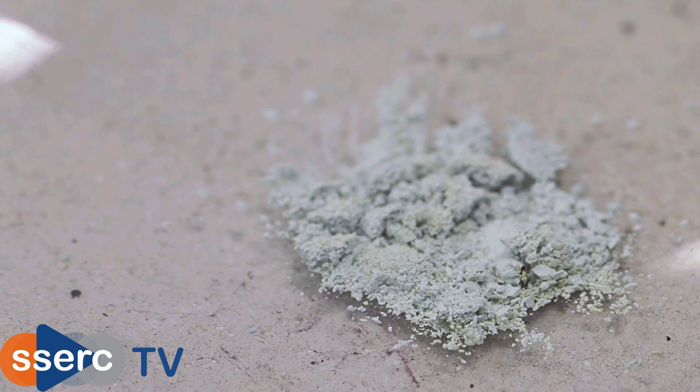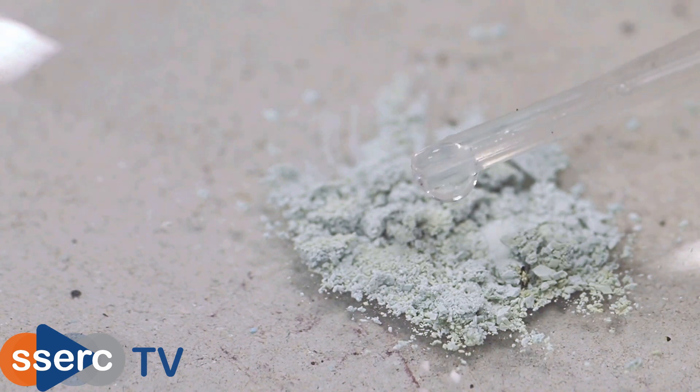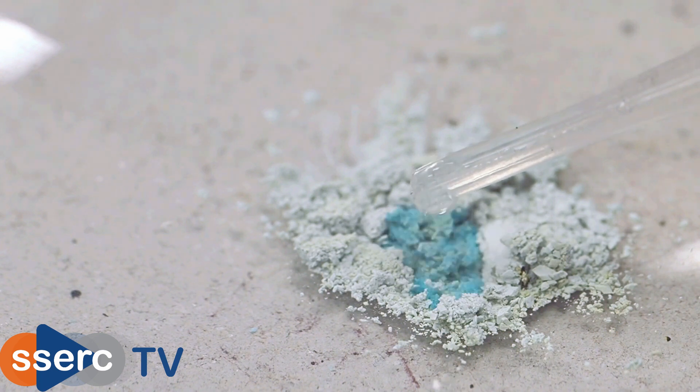As you can see we have an off-white powder. This is anhydrous copper sulphate. Let's see what happens when we add water back to it.